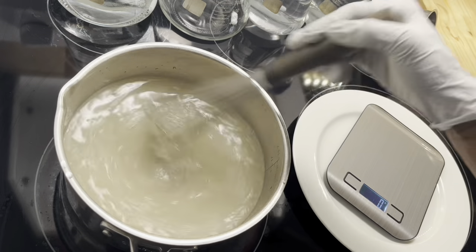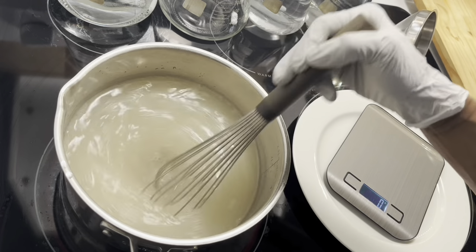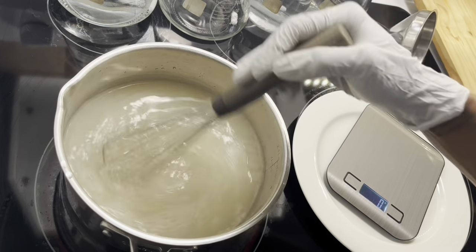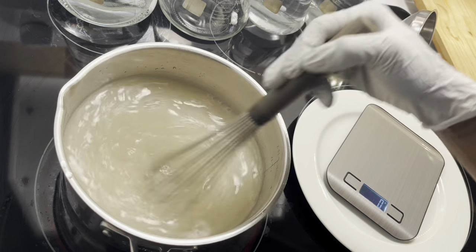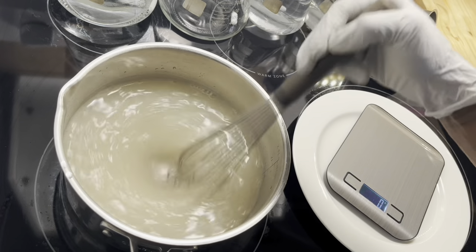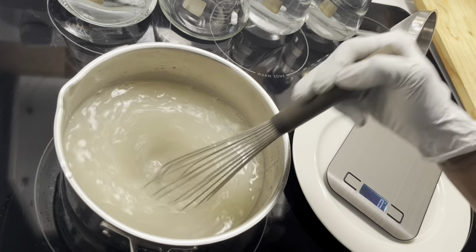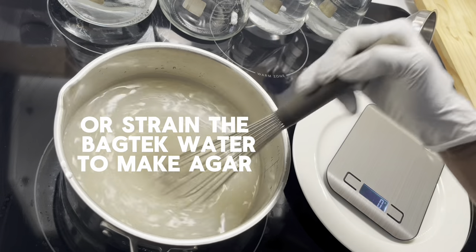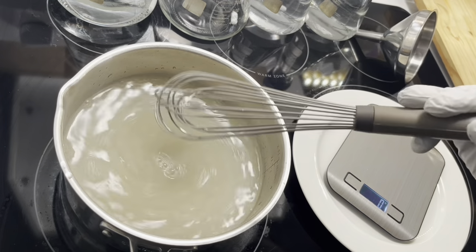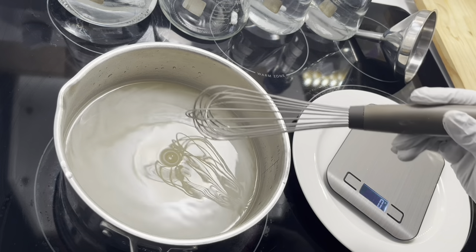Another option: if your substrate is manure but your genetics were accustomed to CVG, you might want to use that same process. Whatever your substrate is — like how you'd pasteurize it in a bag — you could do that in a small muslin bag or cheesecloth, cook it in here, strain it out, and use that water to make your agar. I should have gotten the water hot before we started to speed this up.